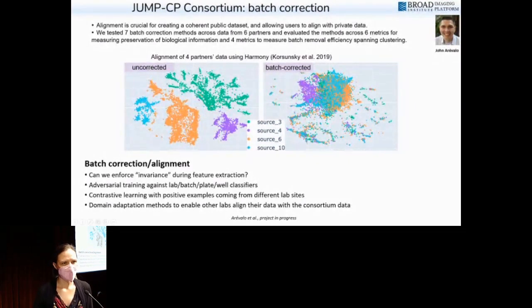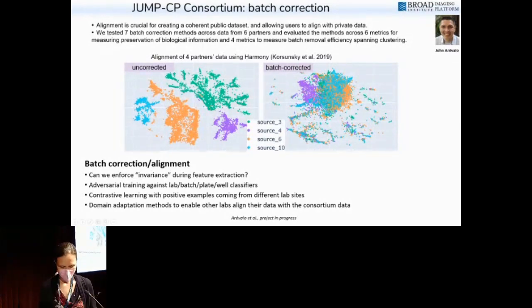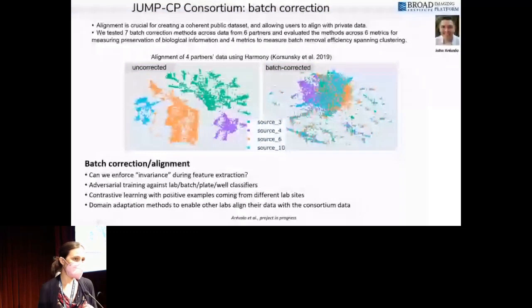Thank you very much for a very inspiring talk. Maybe a main question: is there any way to enrich this microscopy with 3D pictures? Can you do different layers and add this to your data sets, both for screening and for other uses? Yeah, for sure. Everything I described could equally well be applied to time-lapse images or 3D or both.